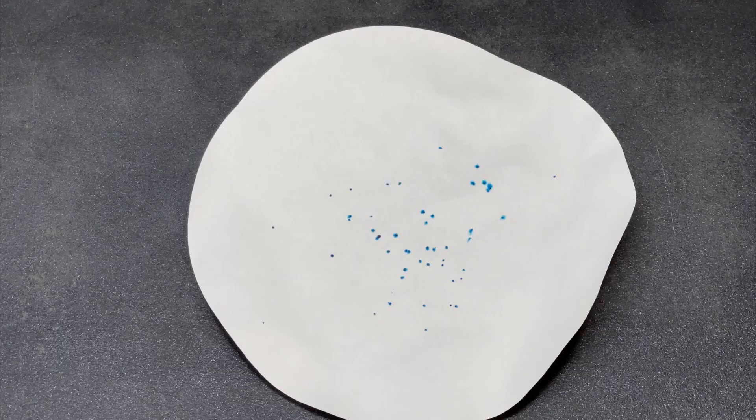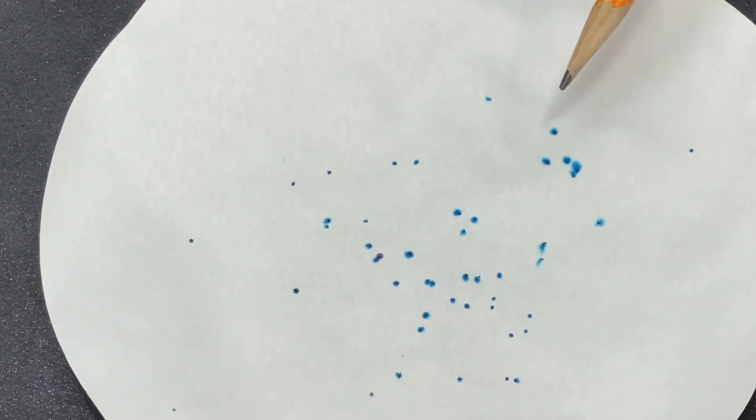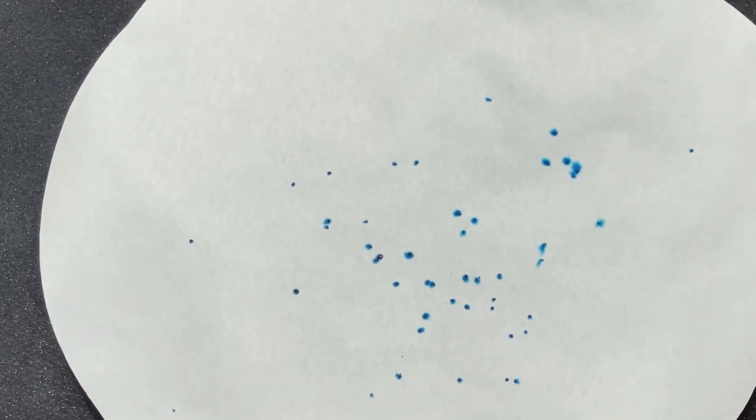Identifiable colored spots should be present, one for each Microtracer particle. Count the colored spots by hand using a pen or pencil to mark each spot, or by using the Microtracer automated spot counting app.